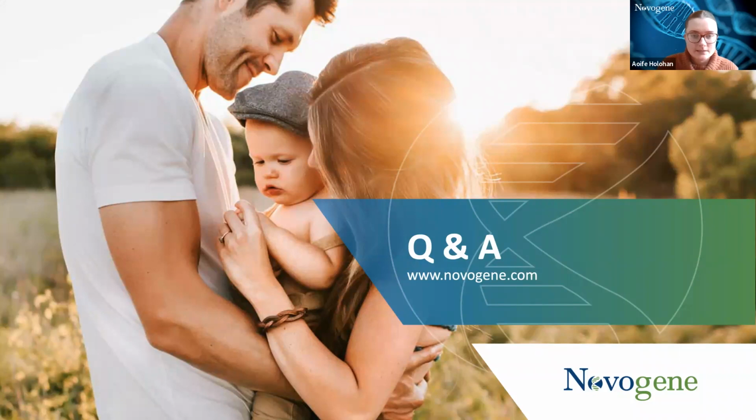Next question is from Carolina asking, what's the difference between edgeR and DE-seq2? Yeah, so these two tools are very famous, and the situations we use them in are different. When you have replicates, you would go for DE-seq2, and when you do not have replicates for your analysis, you would go for edgeR. Yeah, and that's the difference between DE-seq2 and edgeR. Thank you, Aoife. Thank you.